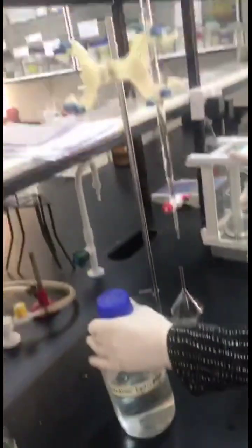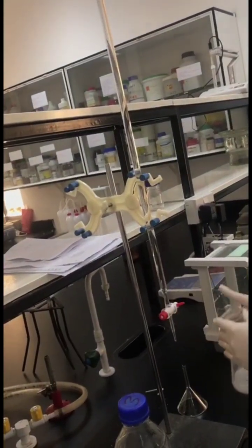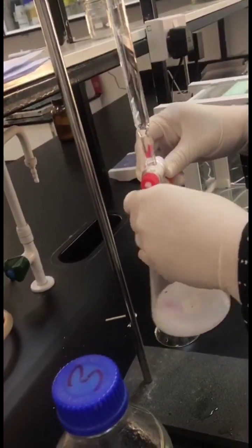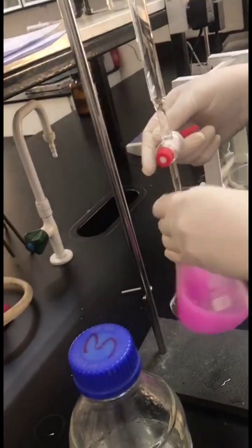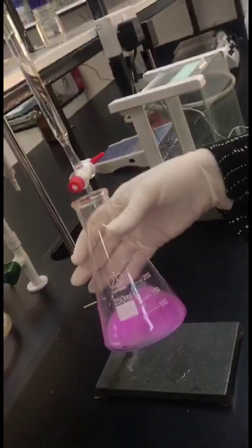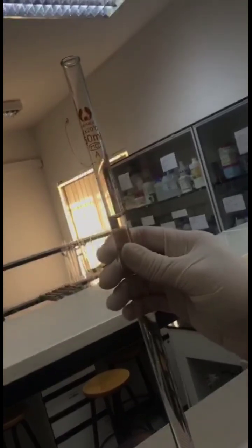So we add 50 ml of NaOH 0.1 molar in the burette. This is our endpoint, and it consumes 4 ml of 0.1 molar NaOH.